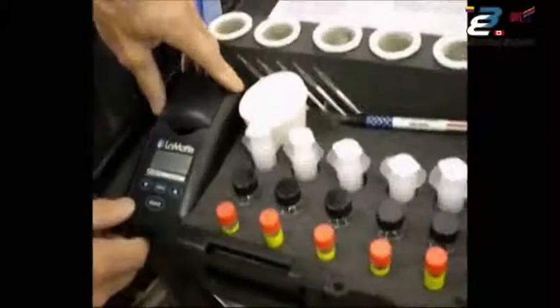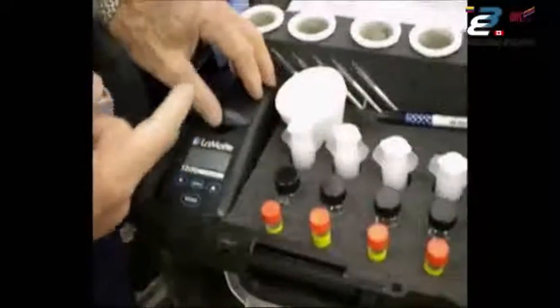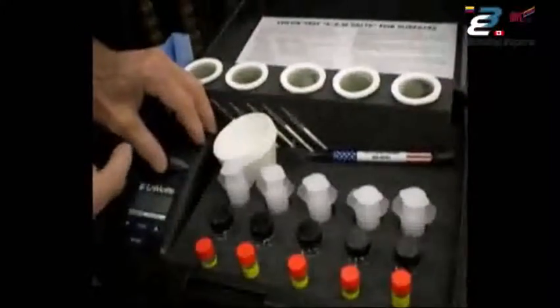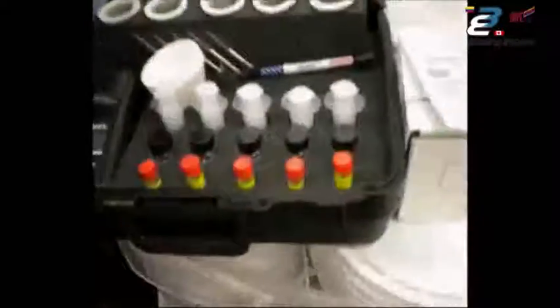What the meter actually is is an electronic eye that looks through the bottle and measures the opacity of the solution. If you've got dirty fingerprints on there, it can affect that reading, so we provide the wipes to deal with that.